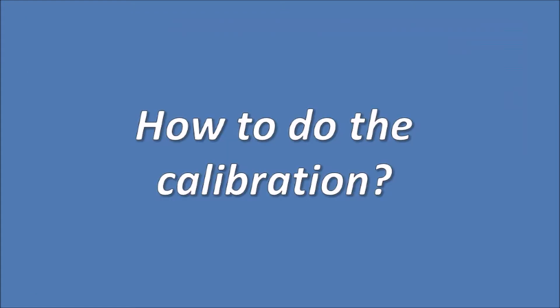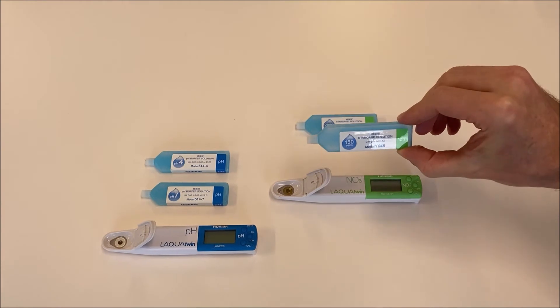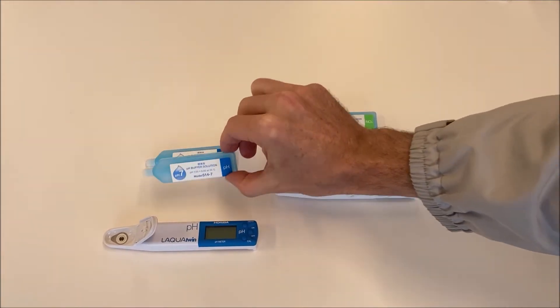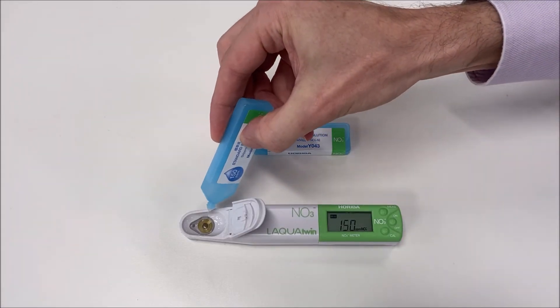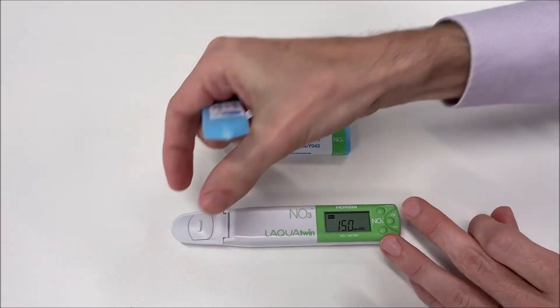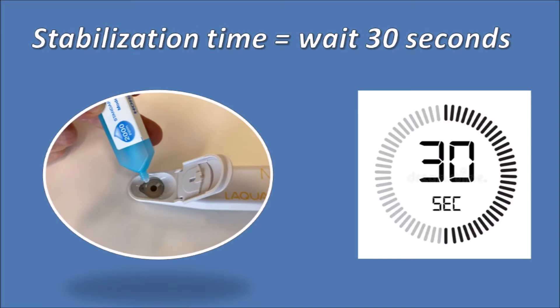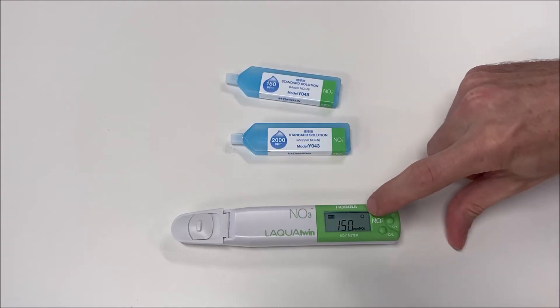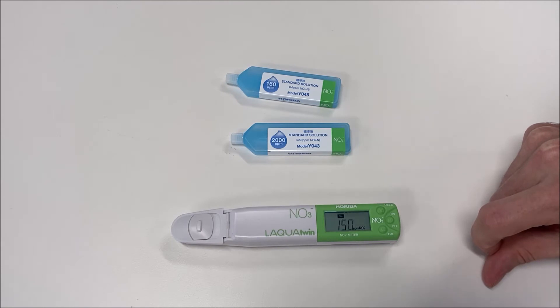How to do the calibration? The electrode must be conditioned if the meter is new or has been stored for two weeks or more. Follow the link to the Meter Conditioning Video. Start the calibration with the lower calibration point first, or pH 7 solution for pH meters. Add a few drops of calibration solution to the sensor, covering both sensor areas. Horiba recommends waiting about 30 seconds. The smiley face icon will be displayed, indicating that the electrode reading has stabilized. Press the CAL calibration button to place the meter in calibration mode.